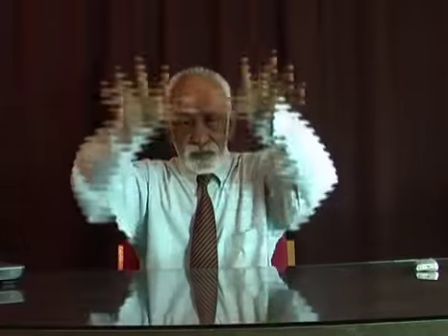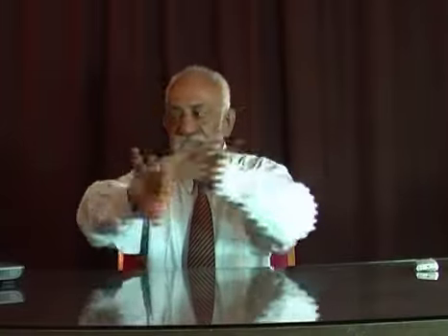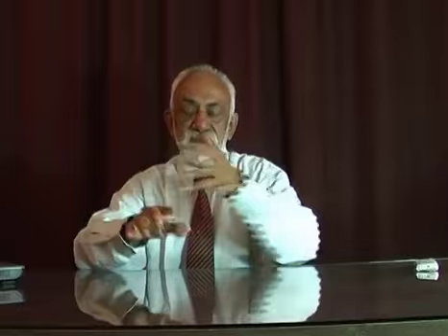Smoke testing will help you. Once you are having airflow smoke pattern testing, you put your hands in and see if any of the smoke is coming out into the laboratory environment. This is the best way to check whether your work practices at the workstation are acceptable or not acceptable.